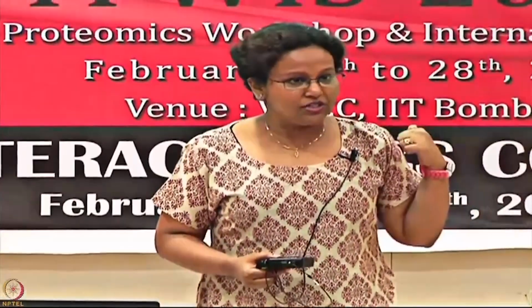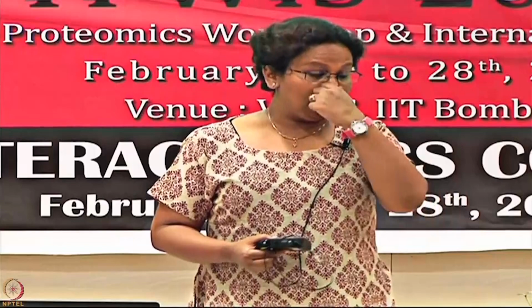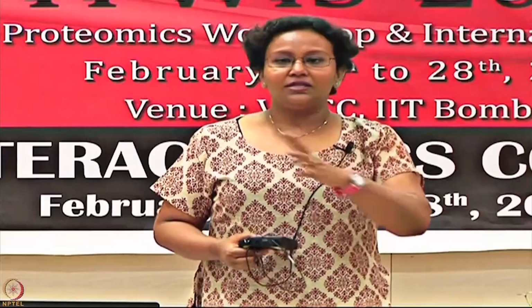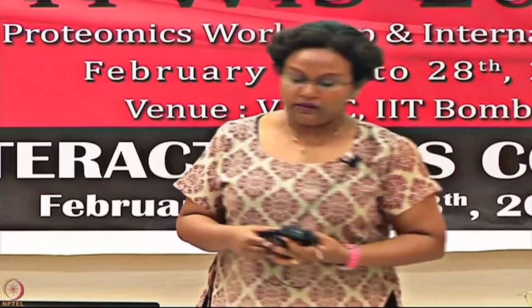The third point is you have also calculated your Rmax, and based on that you immobilized your ligand, and with that, are you getting your Rmax, are you getting your RU or not. These are very, very important things to keep in mind when you are setting up your assays, because if something is not falling in place, it's time to check right there rather than setting up the whole thing and going.